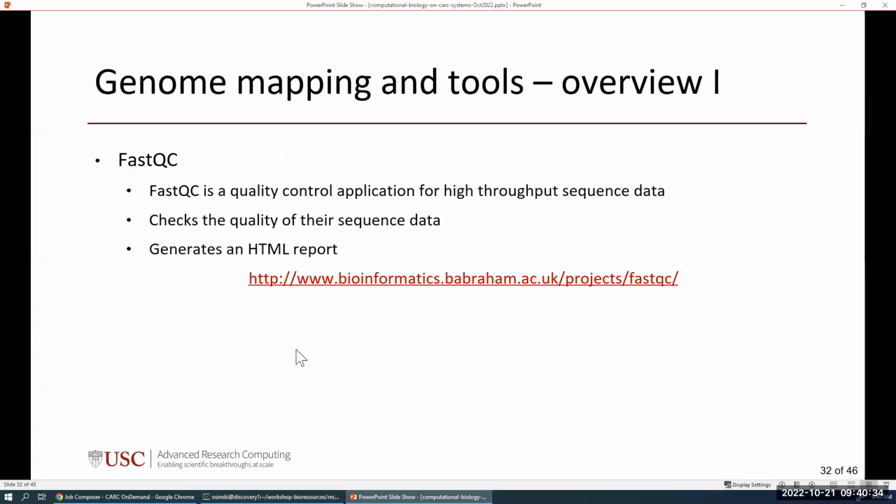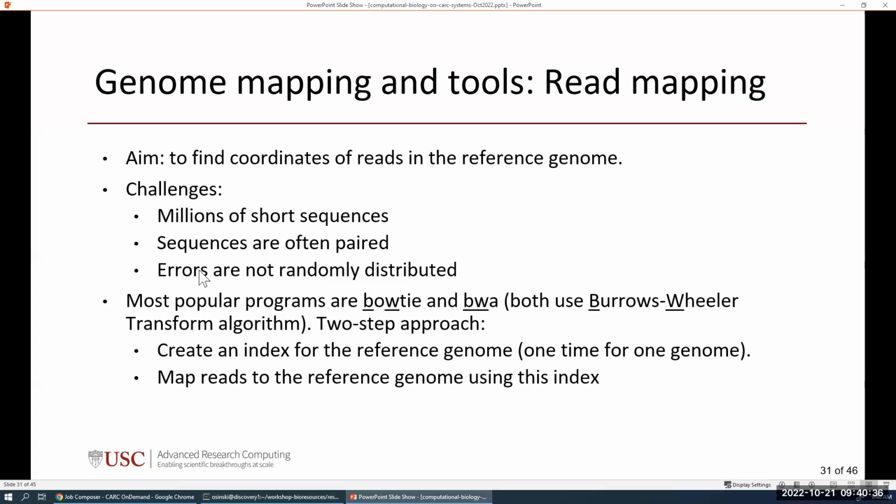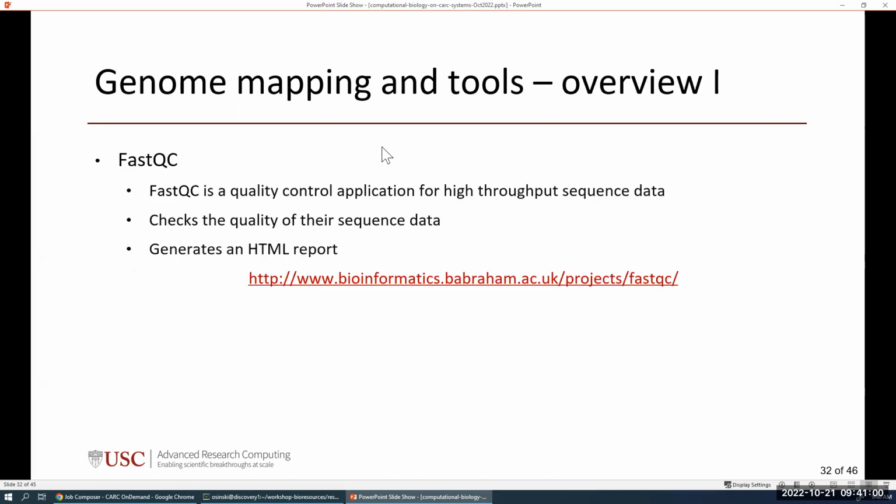Of course, not every example is that simple. So the bigger one I have, the bigger exercise is to go with genome mapping, to actually read the mapping and show that on a genome. So how do we do that? We have to use several tools.